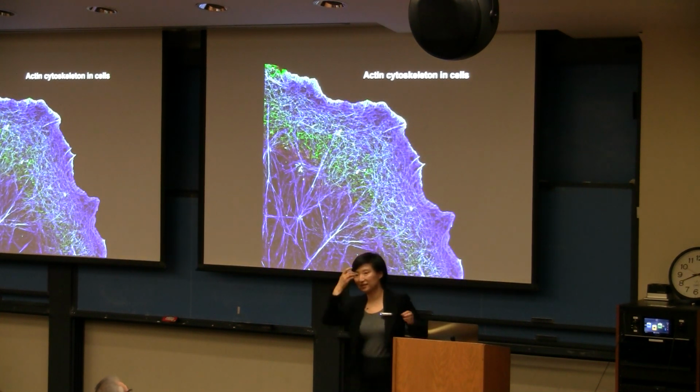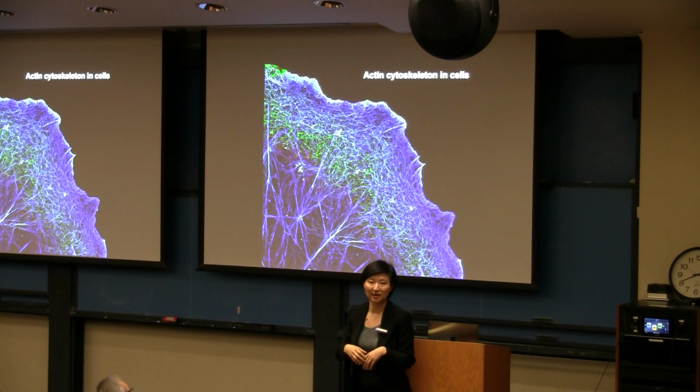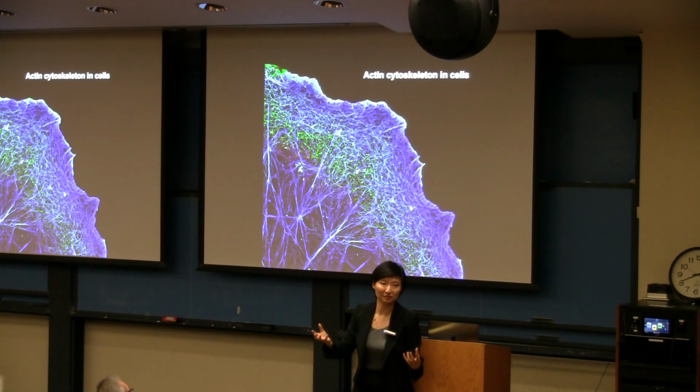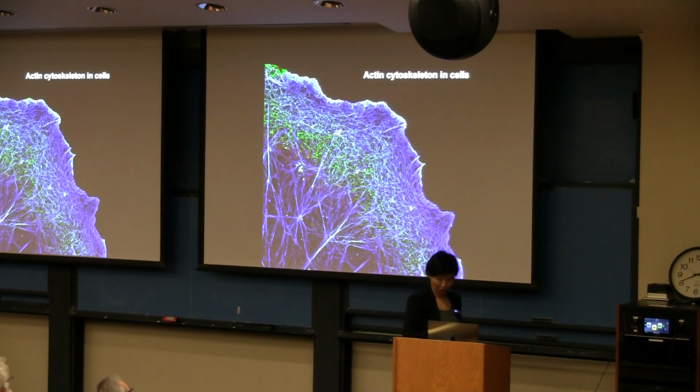In cells, there are what we call cytoskeletal filaments. Actin is one of them, along with microtubules, neurofilaments, intermediate filaments, and so on. In a typical cell, this is what the actin filaments look like. They form long filaments and then crisscross into a network type of structure. And this is a super resolution STORM image with 10 nanometer resolution.